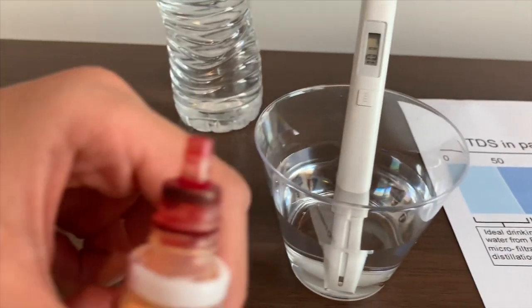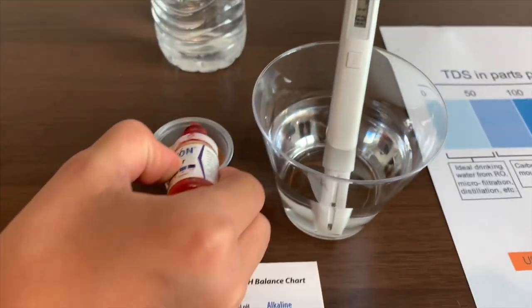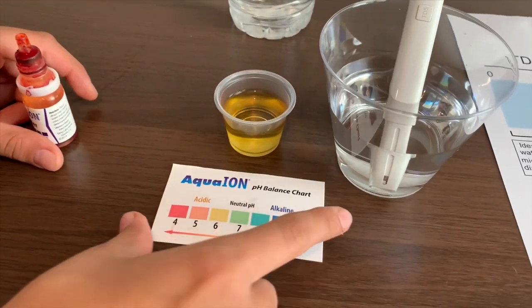Now let's test the pH level. Add 2 drops. That is close to 6.